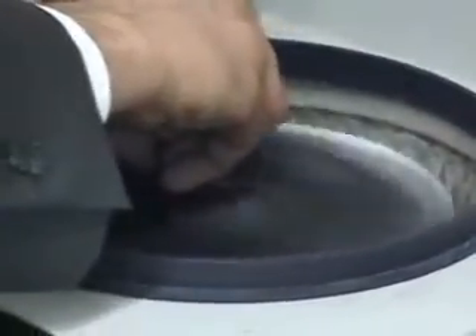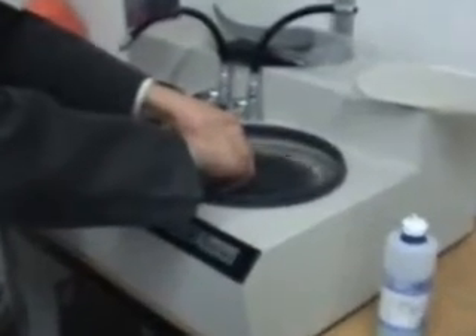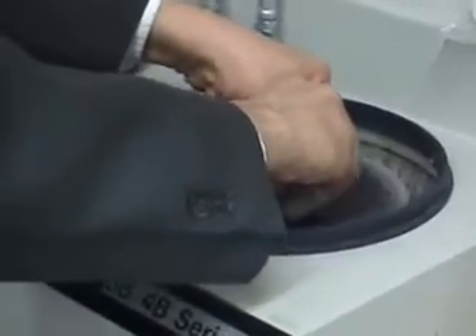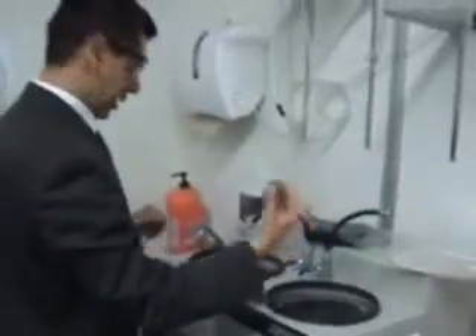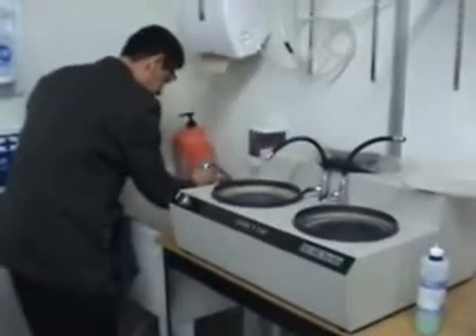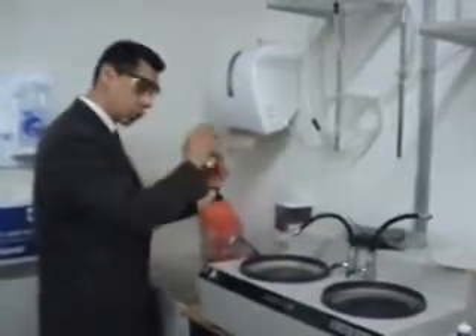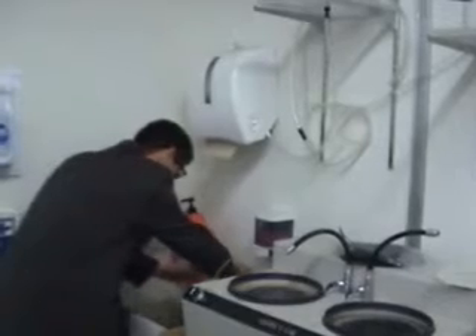After polishing, you have to wash the specimen. The proper methodology is to use soap, then water, then methanol, then an air blower. Use a lint-free cloth to dry it.